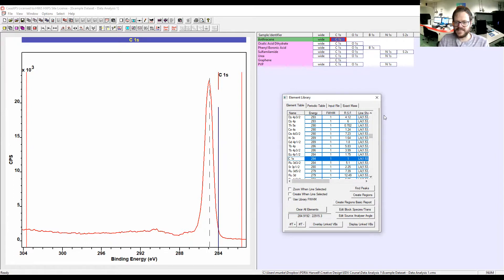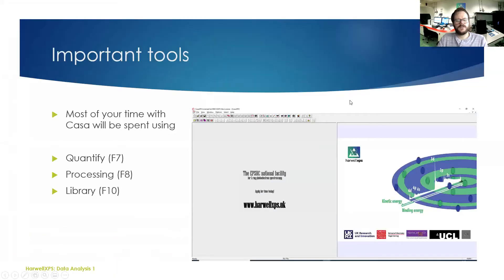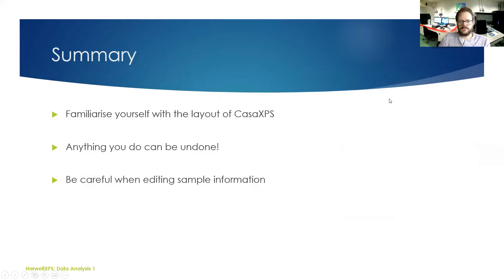To summarize, we've provided you with a bit of an example data set just to have a play with. Familiarize yourself with the layout, play with some of the different options. Anything you do can be undone. The only thing you need to be careful of is if you are editing sample information, probably make a copy before you edit anything, just in case you overwrite something that contains some important information that you now need.